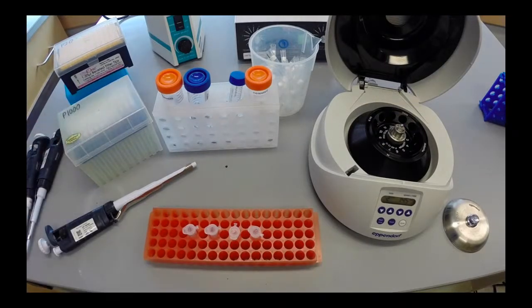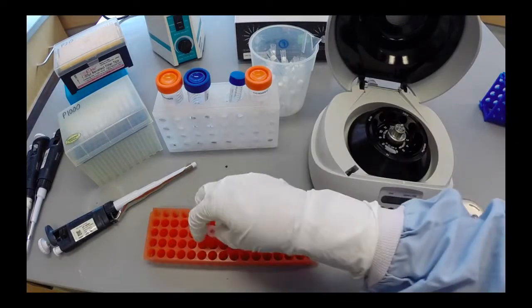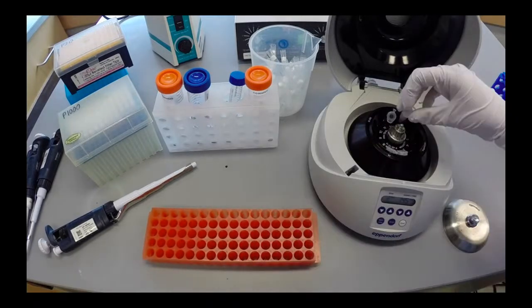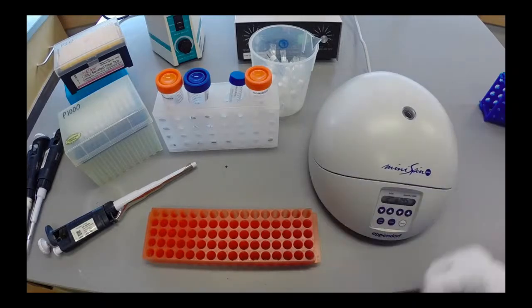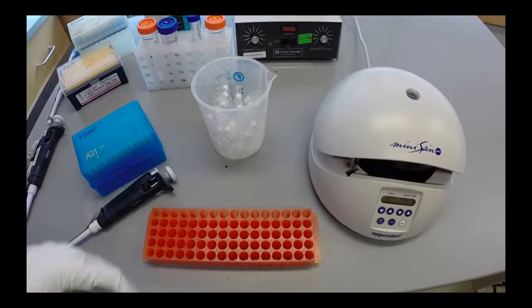Place the samples in the centrifuge, being mindful of balance, and spin for 2 minutes. Remove the tubes from the centrifuge carefully.